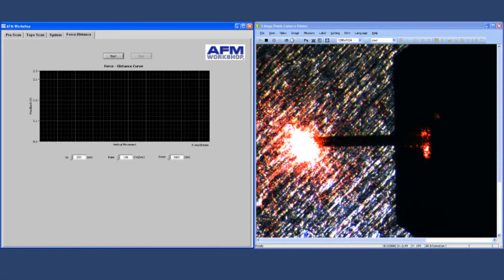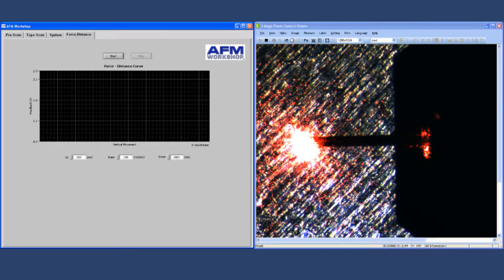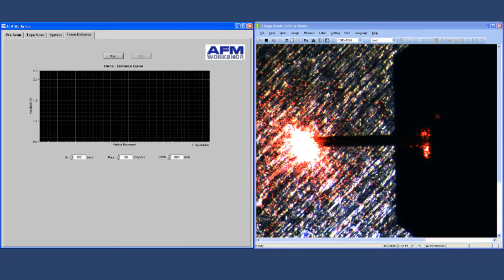The final tab is for measuring force distance curves, and this is a standard feature on many of the atomic force microscopes. It allows you to measure the deflection of the cantilever sensor as a function of distance from the surface.